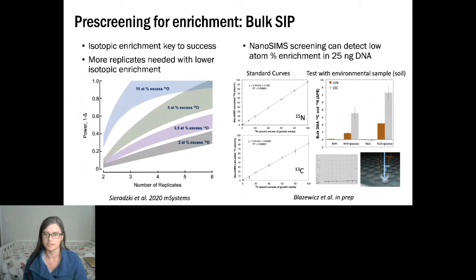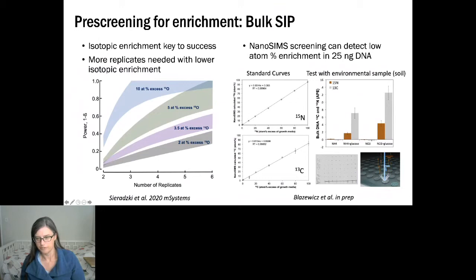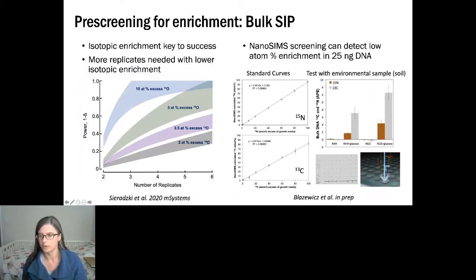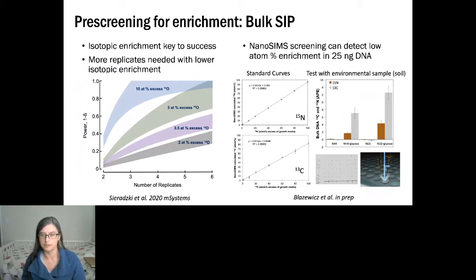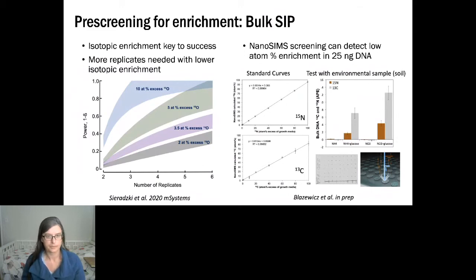We developed a pre-screening process using NanoSIMS — a secondary ion mass spectrometer that performs mass spectrometry on surfaces. We spot DNA on the surface, the NanoSIMS blasts it with a beam, and we quantify how much 15N, 13C, or 18O is in that DNA. This is highly quantitative, detecting low atom percent enrichment from just 25 nanograms of DNA. JGI has also been using MALDI as a pre-screening approach in Trent Northern's lab.